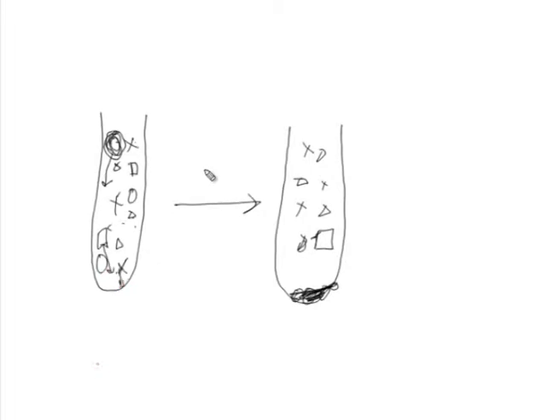What you get is a pellet which might contain a major portion of the larger molecule, but it will also contain other fractions or components, because they are distributed across, and the one very close to the bottom will also sediment in here. Unless you layer on top, this particular problem will be there.